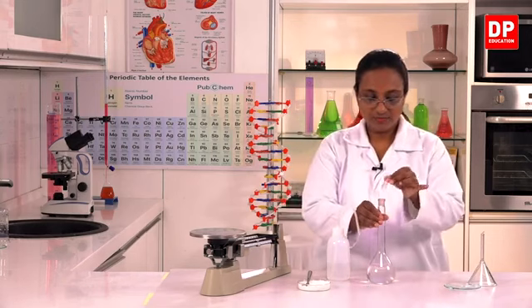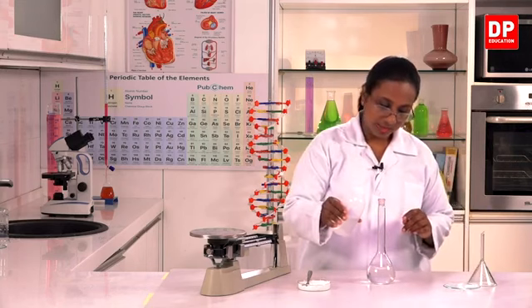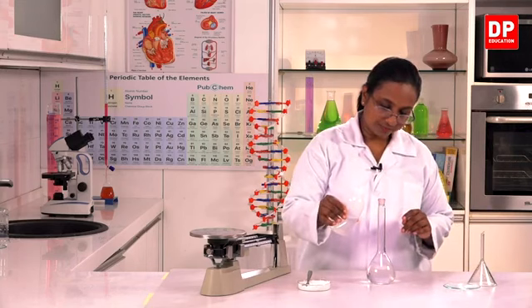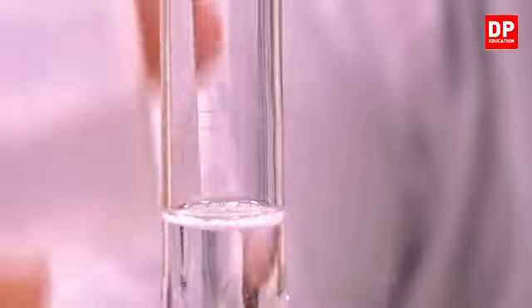So again I'll remove the lid and add more water. Up to a certain point you can quickly add water. Now it's almost closer to the volume mark.